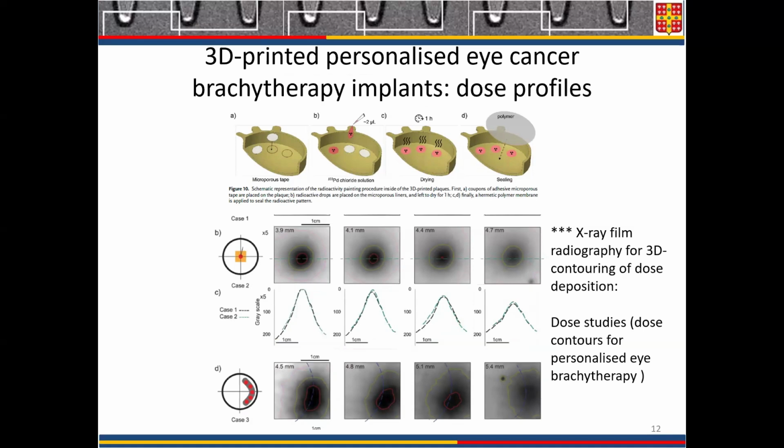First, for the assessment of radioactivity placement in the 3D printed parts, we started to use 2D radiographic films, and it was pretty clear very early on that 2D radiographies were not a good tool for our applications. This initiated 3 projects here in the room related to dosimetric hydrogel. So instead of using a radiographic film, a 2D object, we use dosimetric hydrogel. We have not invented the dosimetric hydrogels, but we, being Marduk, my student over there, and other students in the lab, have worked really hard to adapt these gels to the realities of the radioactive 3D printed devices.